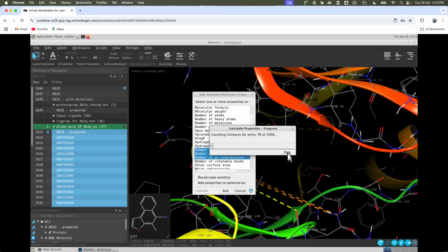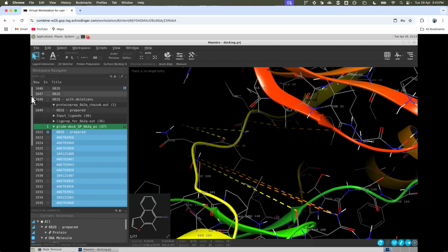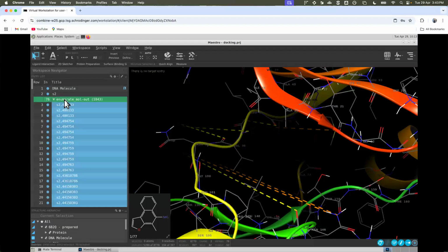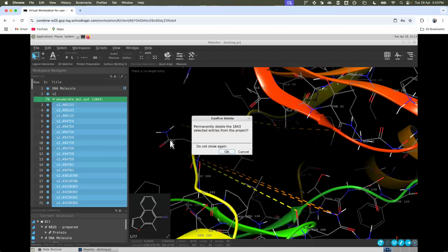Yeah, I'll just stop here. I'm just checking why it is taking too many entries. Okay, it is also calculating for all the numerical entries. That's why I'll just delete this one. Yeah, I think it was somewhat selected.